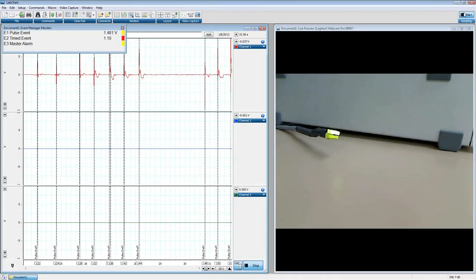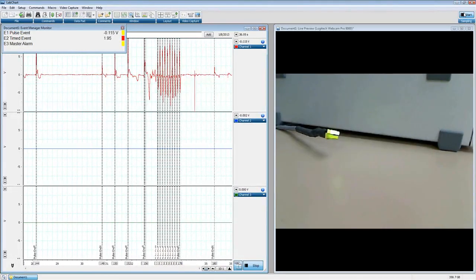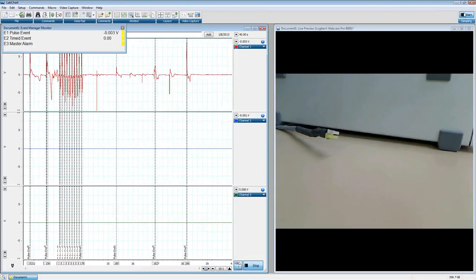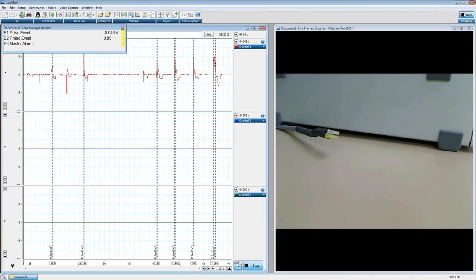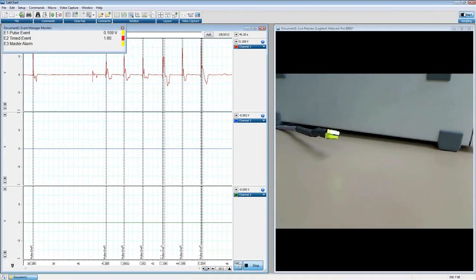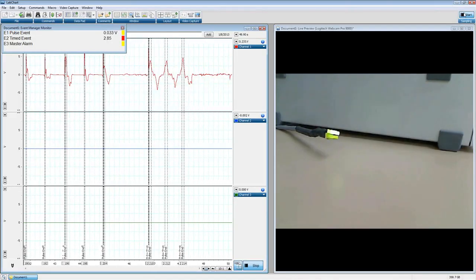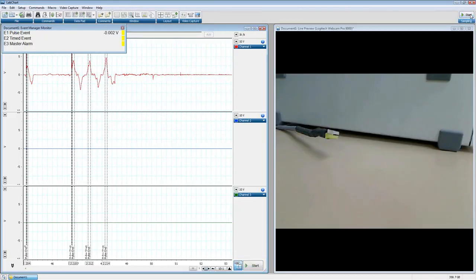Hopefully you can see that on the camera. You can see it flash the bottom light. Ever so slightly. There we go. So, great way to link different events together and to actually either tell our devices to do things, show warnings, et cetera, et cetera.